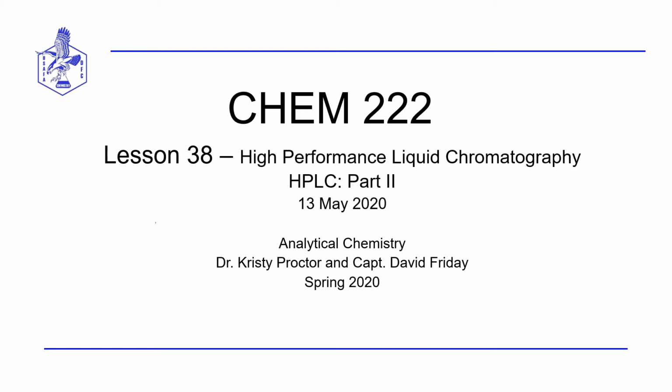Welcome, Chem 222 cadets. This is Lesson 38, High Performance Liquid Chromatography, Part 2, in which we consider the impacts of mobile phase selection.